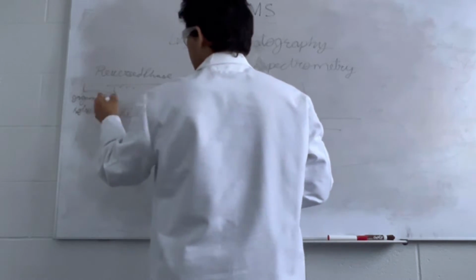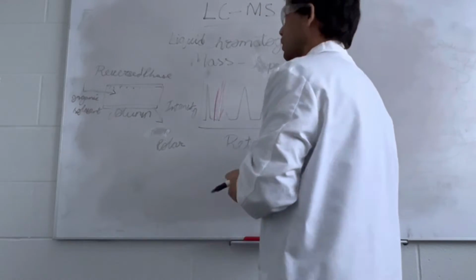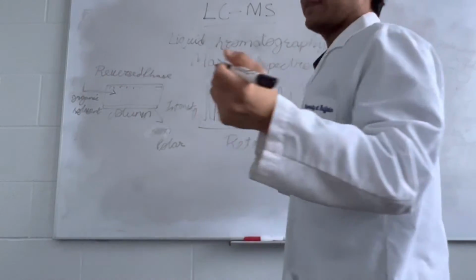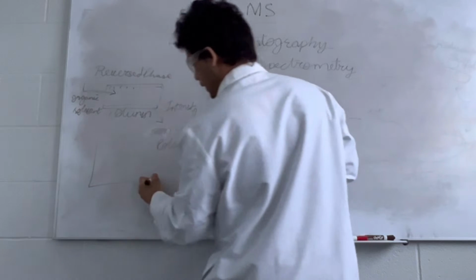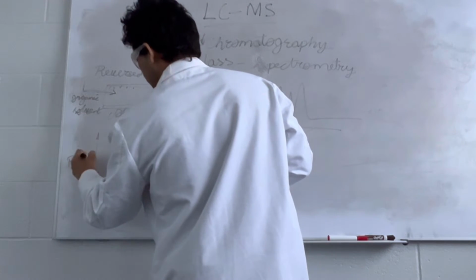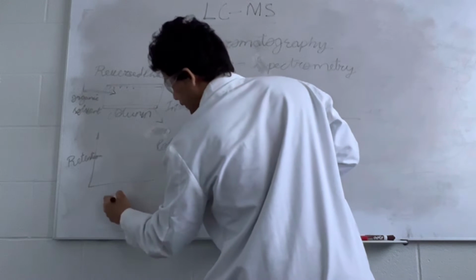This organic phase is more strongly non-polar, or you can say a strong eluent. Let us understand with the help of an example, with retention time against pH.